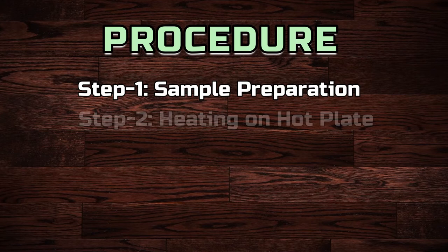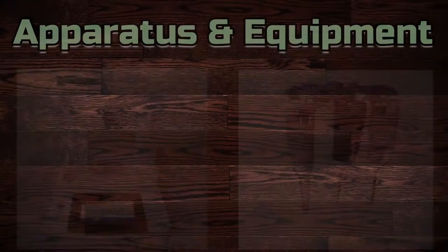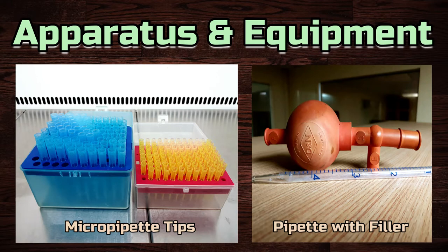The test method involves 5 simple steps: sample preparation, heating on hot plate, result observation, positive control test, and result interpretation. To conduct the test, we need balance machine, micropipette, hot plate, glass tube, cork with hollow tube, micropipette tips, pipette with filler, sulfuric acid, methanol, and boric acid powder.